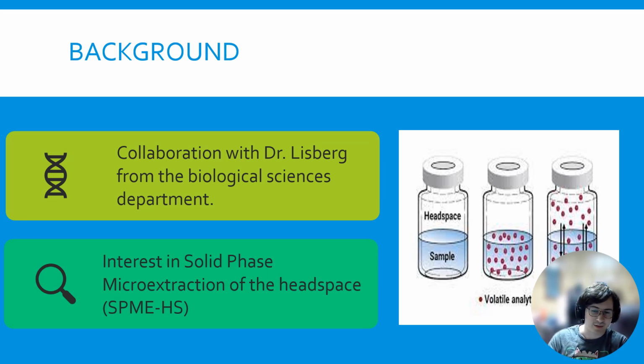There's a little picture behind my little head bubble here. It shows that it's just a sample headspace, and then stuff evaporates into the space above, and that's what we're looking at.